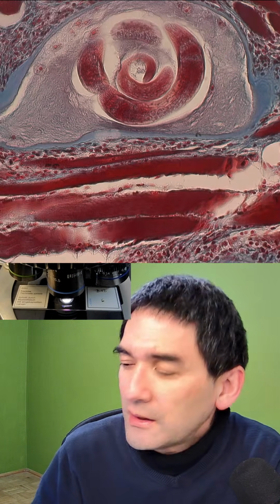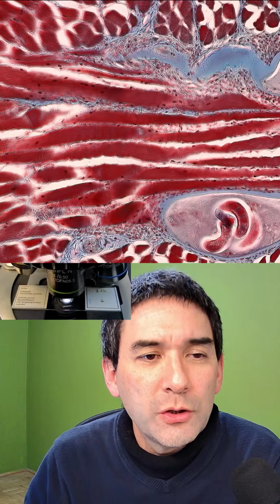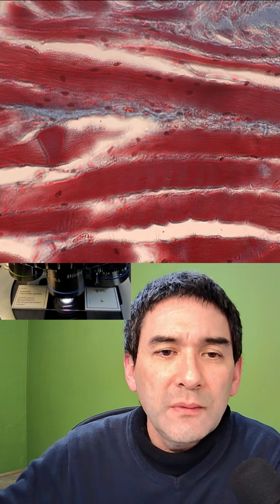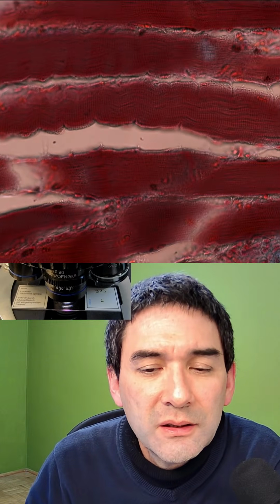So, but we can go down a little bit with the magnification. Here, for example, is another one. So it's another cyst that you have over here. The reason why I like this slide so much is because you can actually see the muscle fibers quite well, and for this reason, I'm really going to go in. I'm now at 60. Let's open it up a little bit. Okay. And what you're able to see then are those long cells here.